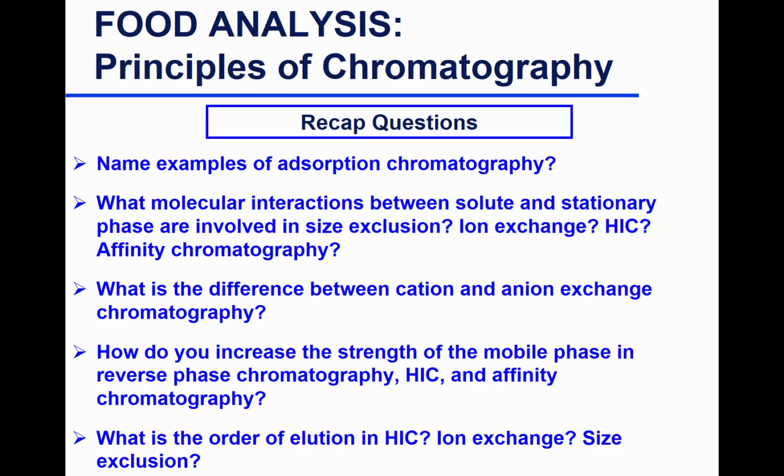In affinity chromatography, how do you increase the strength? Yes, Sven? Changing the pH could be one, yes. If you want to do a very specific type of changing of the mobile phase, what would you do? If you have a ligand, yeah.